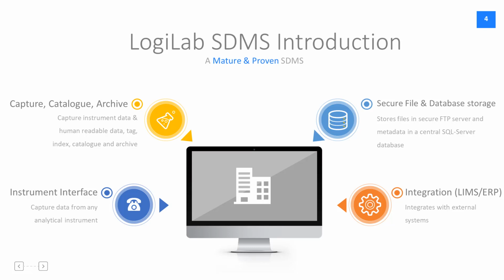Logilab SDMS has been designed for integrating external systems like LIMS, ERP systems, or an electronic lab notebook system. There are appropriate middleware tools available for integrating external systems through the Logilab SDMS system.